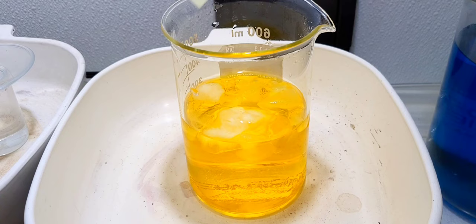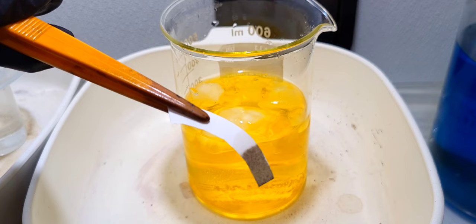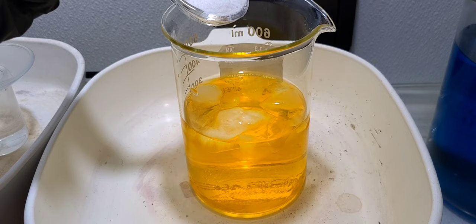I put some ice in there to cool it down because we're about to perform an exothermic reaction, so I want to start cool. But first we're going to test it with some stannous chloride. That proves that we have gold in solution here. We want to do that because later on we're going to test it again to prove that we've gotten all the gold out.